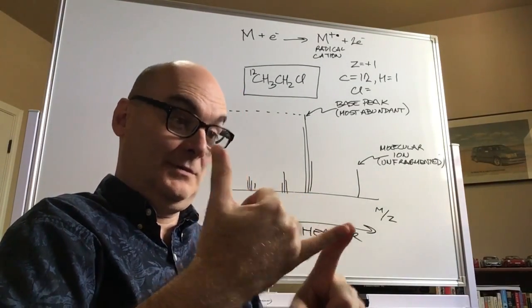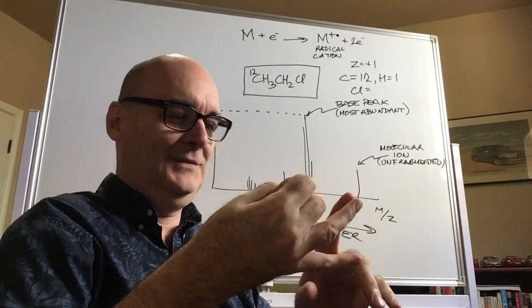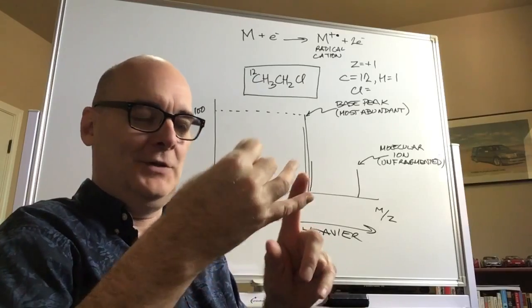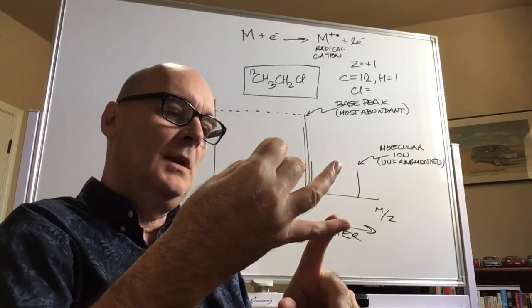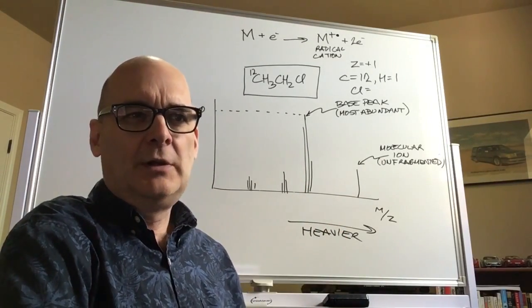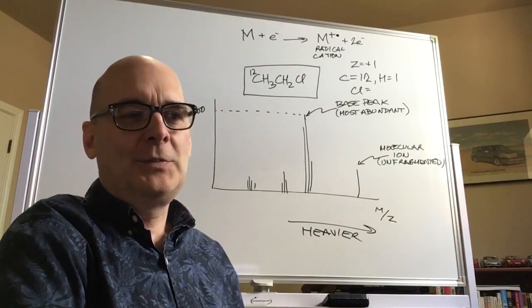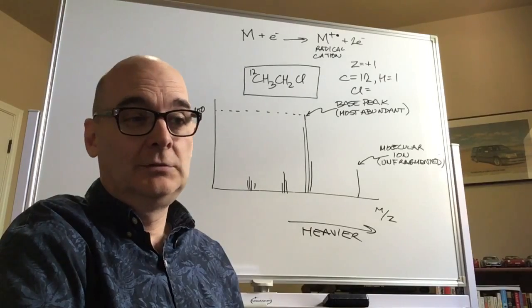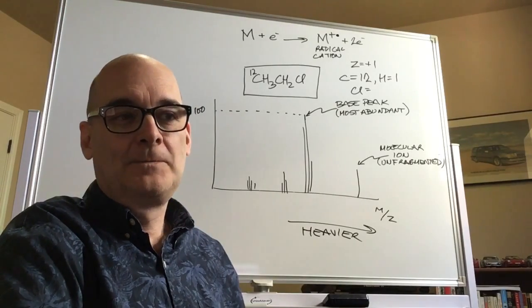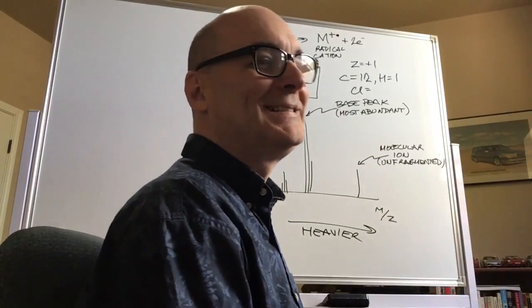The weight of the protons and electrons. No, I mean neutrons. Electrons weigh, you need 1,837 electrons to weigh the same as a proton, so that's not going to matter. It's the number of protons and neutrons, and because those are integer values, I can never have a fractional number. The number on the periodic table is a weighted average of the isotopes of chlorine. And the two common isotopes of chlorine are 35 and 37.